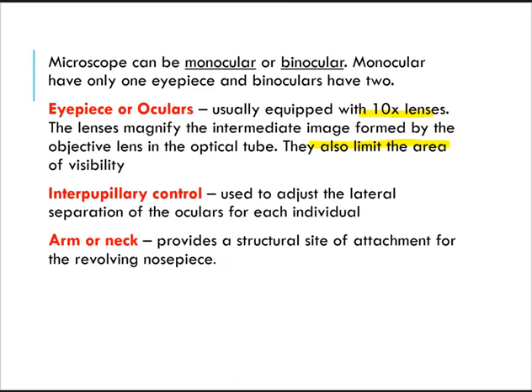What they do is view the microscope using just one eye and close the other eye, which is not comfortable.